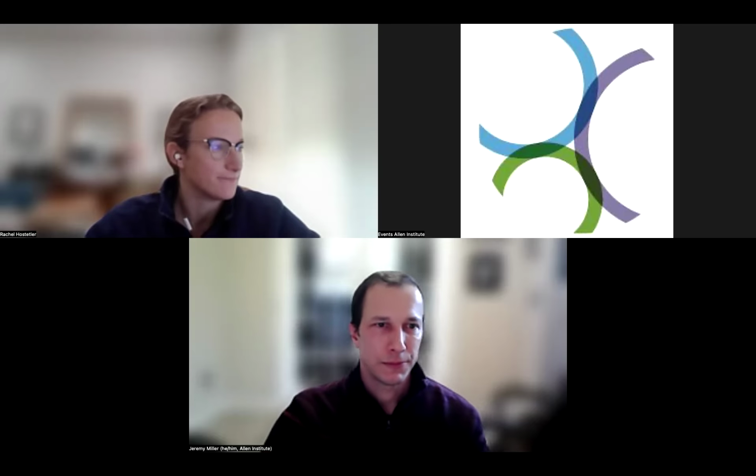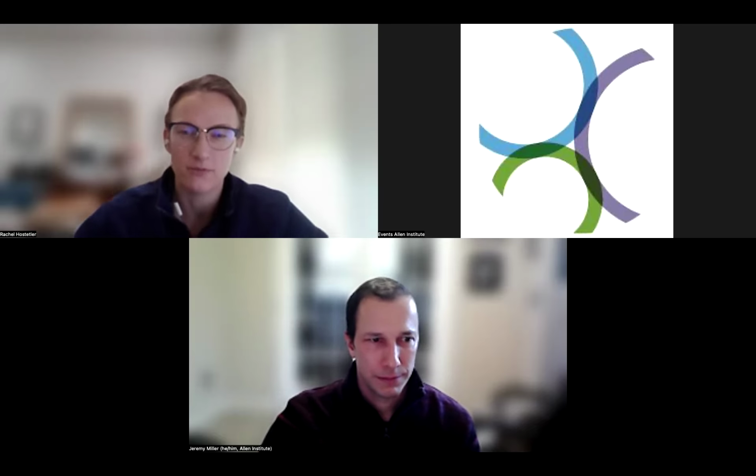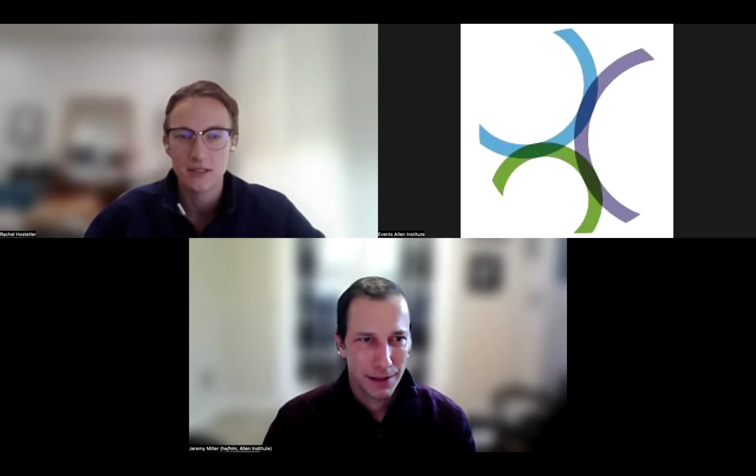Another question that I thought of is, there's also patch-seq data in the Annotation Comparison Explorer as well, right? Because I don't believe that was mentioned in this webinar. If you could give a few comments or thoughts on that, or maybe potential use cases.